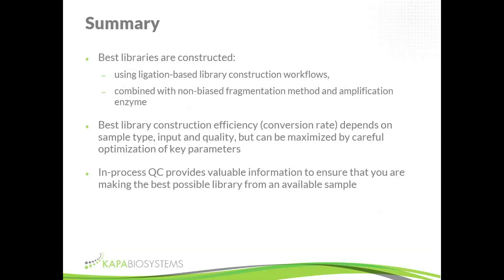That's pretty much it. Just a final comment: once you have a well-optimized protocol, it isn't necessary to do the post-ligation qPCR. It just slows you down. But once you've characterized your workflow, you know it's optimal. When it breaks, you have tools to say, well, I know it was optimal from the beginning, so it's not a question of it needing to be optimized even further. It's breaking because something that was okay has gone off.